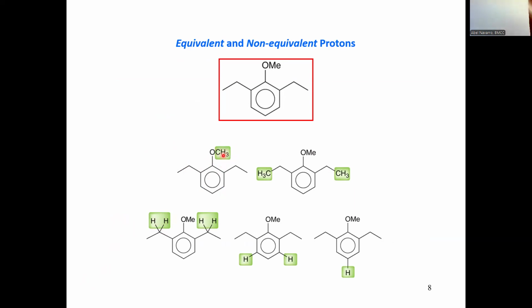Yes. Why? Because they are attached to the same carbon. They are CH3, single bonded. Remember, a double bond is a problem because it is rigid and doesn't move. But in this case, the CH3 has free rotation. Imagine my 3 fingers right here, they move in any direction.